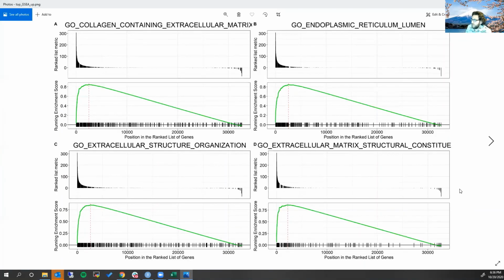All right, so now I've got my figure showing my top 4 overexpressed gene sets. And I've even got little figure labels like A, B, C, D. I don't know if you'd actually publish something that looks like this. It's probably more for lab meeting, but it's still nice to be able to do that. This might be how I would present this, for example, in a lab meeting. And if I was willing to put in some more time to clean it up, possibly in a paper.